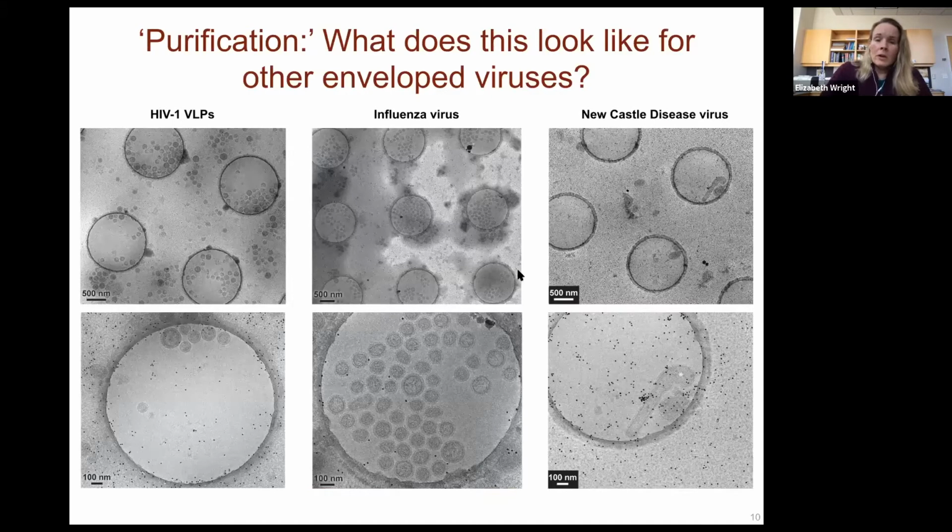Well, at first, maybe we have no choice. And so we're going to look at purified virus particles. We can see these preparations of HIV, flu, and Newcastle disease virus. And so these are pretty good.